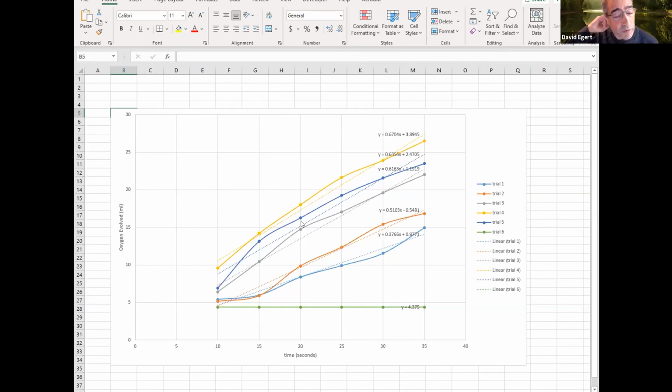Also I would probably redo the bubbles. We didn't do it this time, but Tina and I have been experimenting running the bubbles through a little piece of cloth so they end up a bit finer instead of those big gloopy bubbles that go up the tube, because then you don't have those big discontinuities as a big 5 mil bubble comes up all at once.